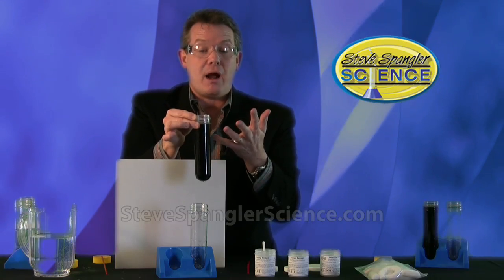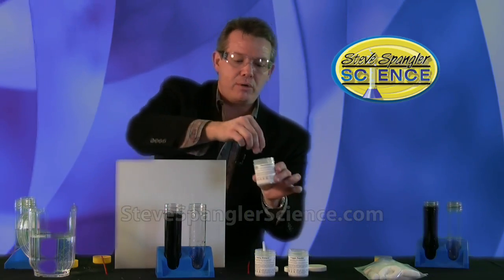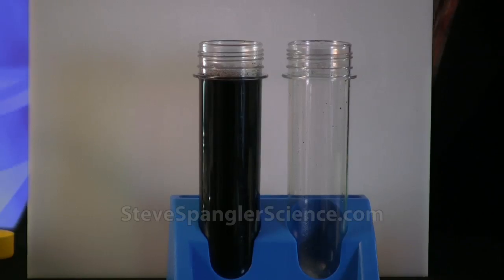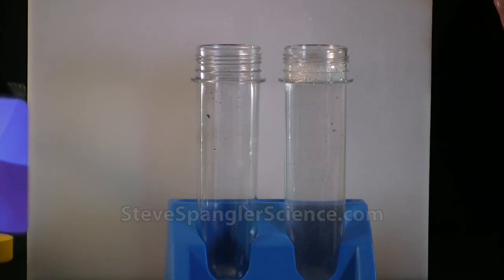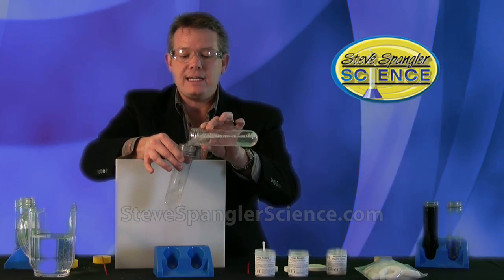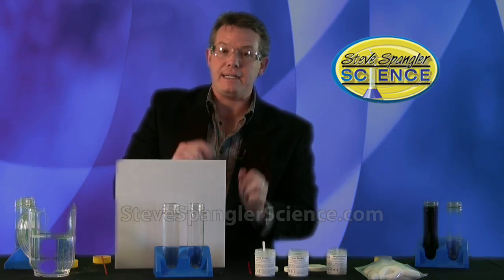At this point you've created iodine, so rather than dump it that's why you have the recycling powder. It's only going to take about a half a scoop of recycling powder — that goes into the empty test tube — and now watch what happens when we mix the two together. We go back to our colorless state and your science magic is done. It's a beautiful reaction, a beautiful example of a clock reaction, and a very easy way to be introduced to some very complex chemistry using redox — reduction-oxidation — and a starch-iodine reaction. Have fun doing Think Ink. Guaranteed to fool your friends.